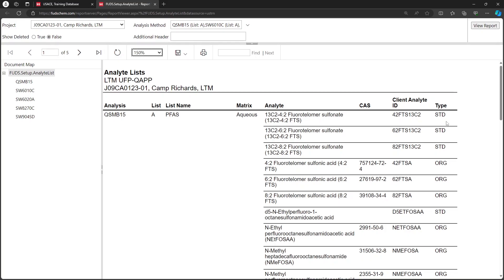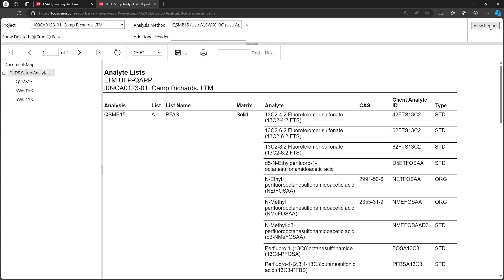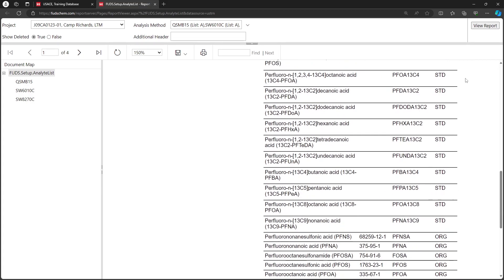The ClientAnalyte IDs column contains the valid values that the labs should use in their SED files. Analytes that were not part of the original method template are highlighted. Contaminants of Potential Concern (COPCs) are shown in bold. To review any analytes that were removed from the original template, set the Show Deleted radio button to True, then click View Report — only analytes that have been deleted will be shown.